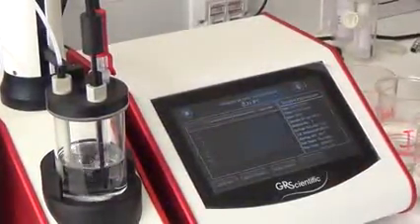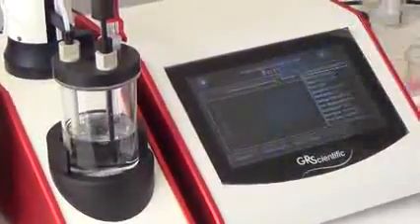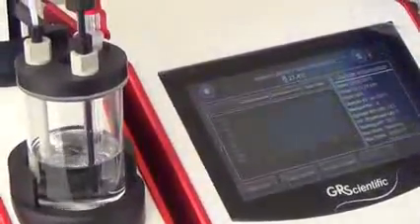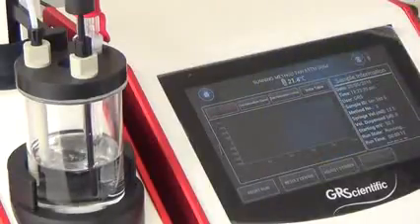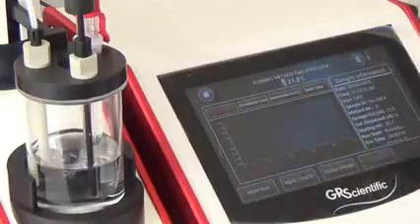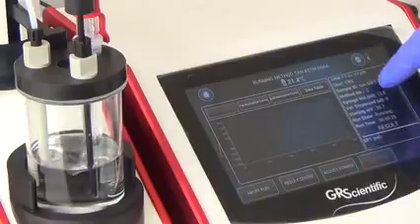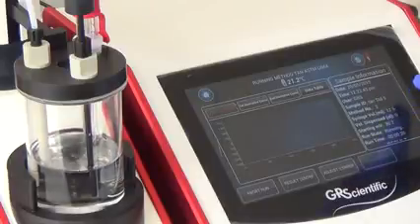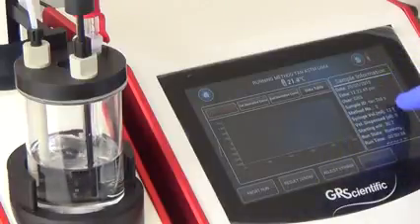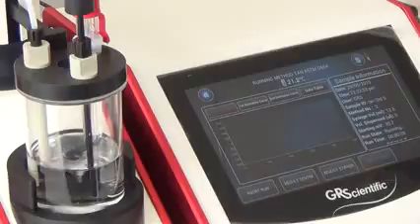And there we go. As you see, our temperature probe. And here we go. At the top here is our temperature in degrees. If you hit that icon, you can see here it's in centigrade. Again, same sample information. The running state, the run time, the volume dispensed. Because it's a sample, I've put in a time delay on this. It tells you the method number.